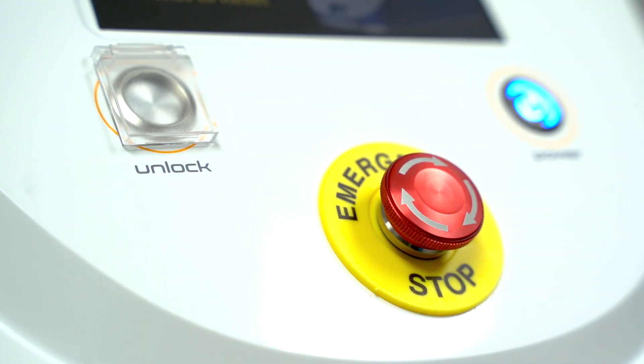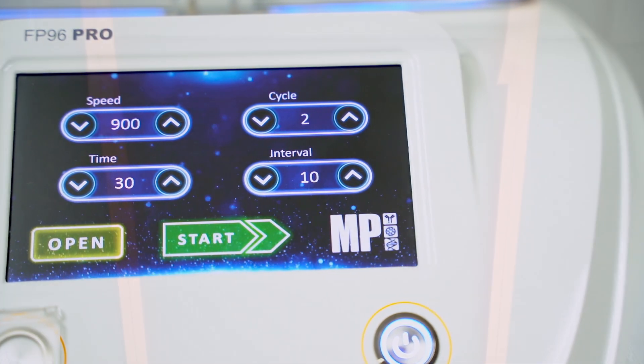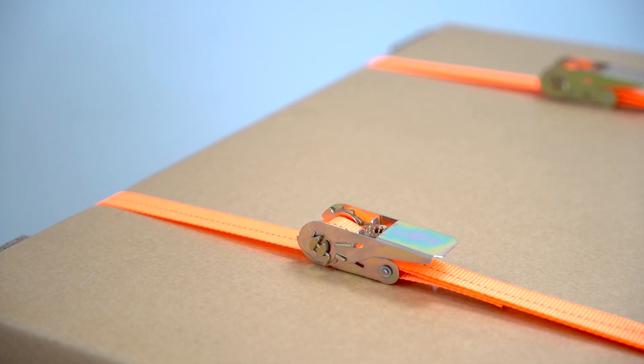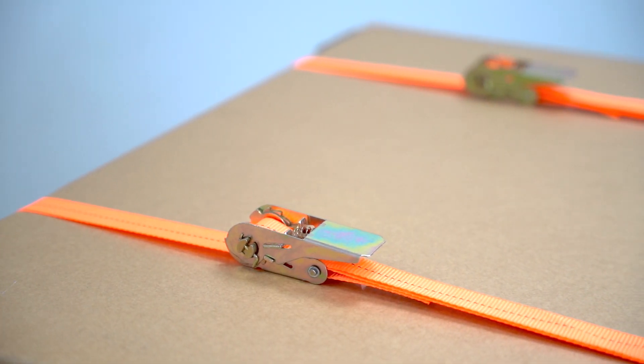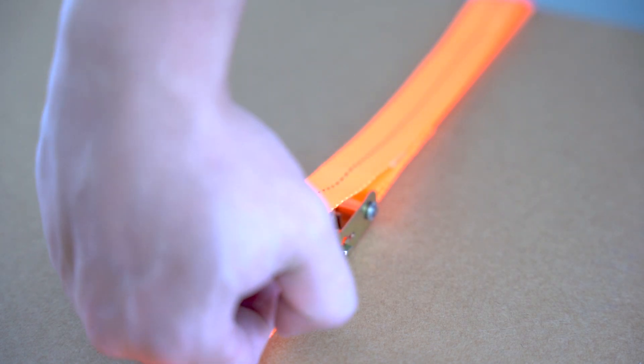Let's dive in and see how it works. Upon receiving the FastPrep 96 PRO, inspect the box for damage before unpacking. Unlock the ratchet strap by pulling up the lever, push down the tab while lifting the handle to release tension.